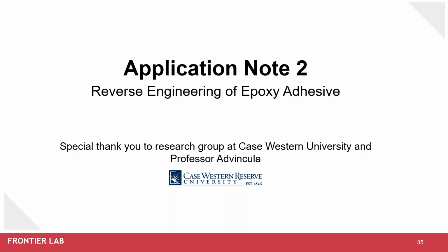Epoxy resins are a class of reactive polymers containing epoxide groups. A reaction could be based on either catalytic homopolymerization or a wide range of co-reacting agents, including polyfunctional amines, acids, phenols, and alcohols. These co-reactants are often referred to as the curative, and the cross-linking reaction is commonly referred to as curing.